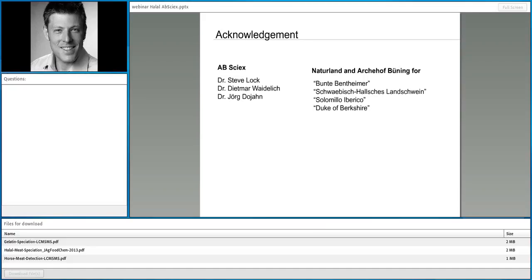I have seen that there is a conference in 1 month in Belfast, the ASSET 2014 conference, and there's something around authentication of spices and also of plants. So in principle, this is of course also achievable. They use other methods, but you can of course use MS, and not really for the authentication, but for the species identification. Allergen detection is similar to that. So if you want to know whether you have hazelnut in your chocolate, this is nothing else than species identification of hazelnut. It's not really authentication, but it's protection of allergenic consumers, so to say.